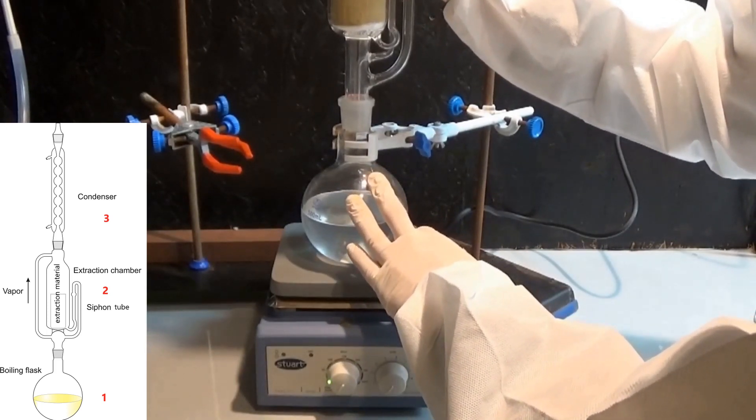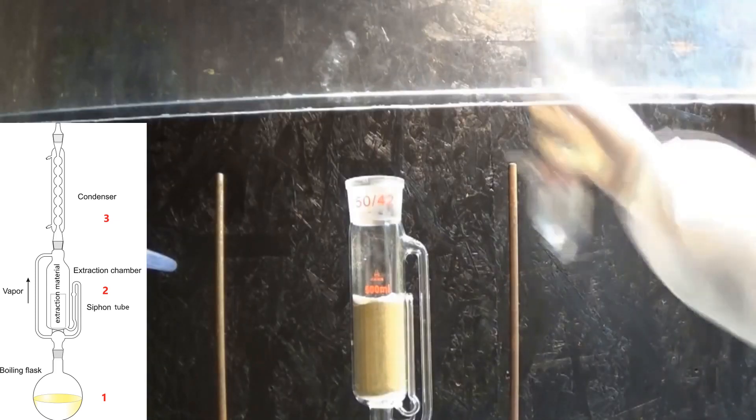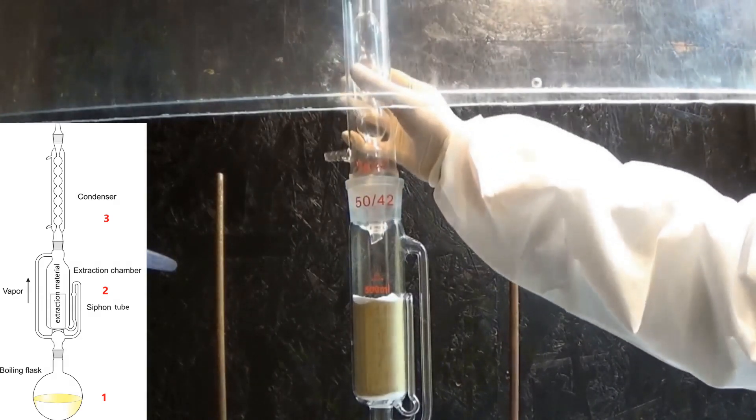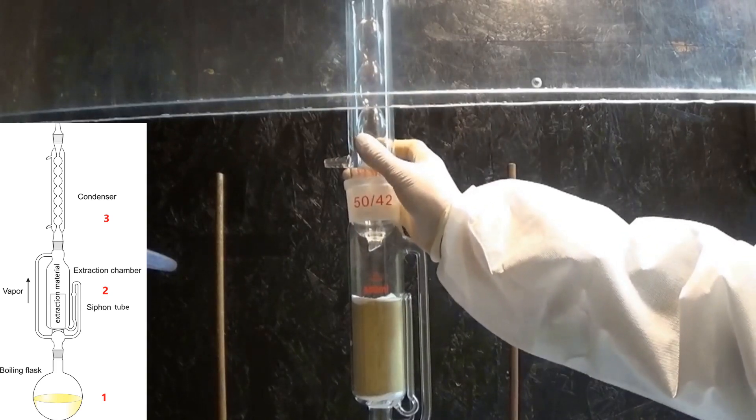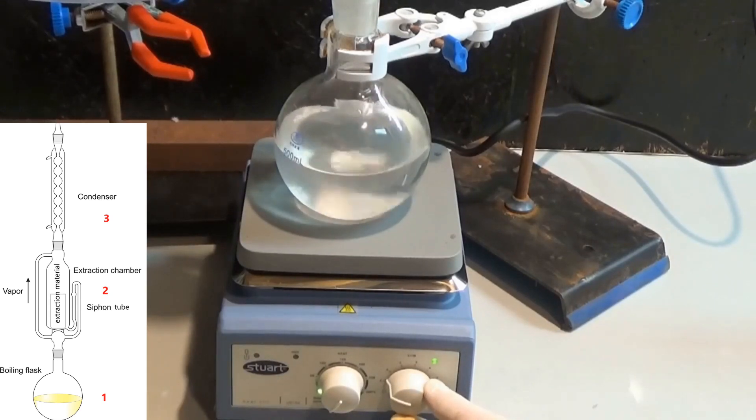Upon reaching the condenser, the vapor turns back into a liquid and drops into the extraction chamber. The still hot liquid solvent reaches the extraction material and solvates some of the molecules that are soluble in it. When the solvent reaches a certain level, the siphon effect kicks in and sucks out all of the solvent back into the boiling flask. Through this process, the extract concentrates in the boiling flask. From there on, the process starts anew.